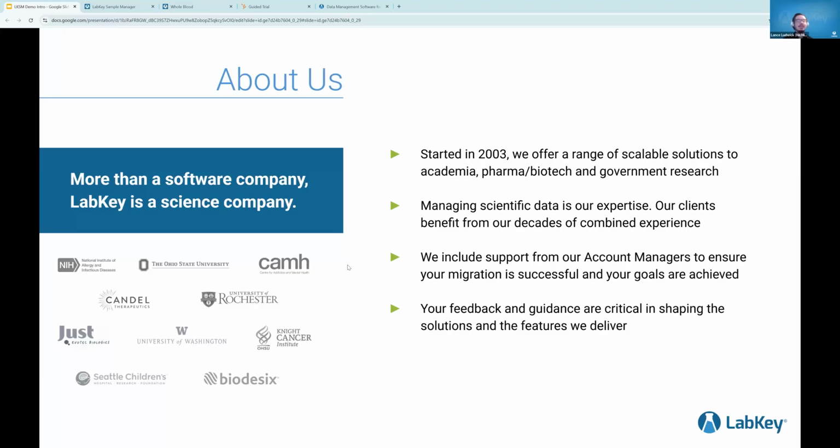And then we work very closely with them to help have expansions within their institution to help them all save on money. But we also make sure that they have customer support at every single point of time that they need it. But then we also work closely to develop our products further. So Sample Manager has monthly updates based off of feedback we get from our users to make sure we're growing in ways that are expected.